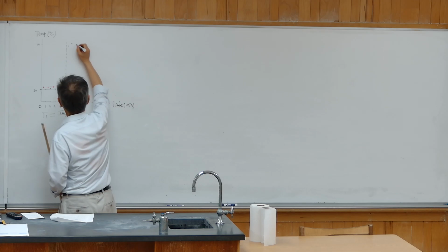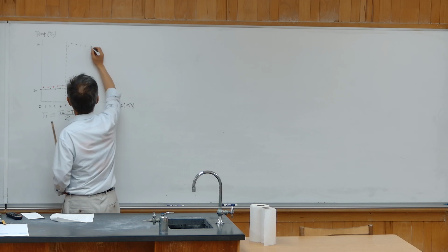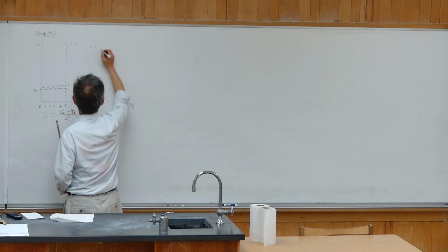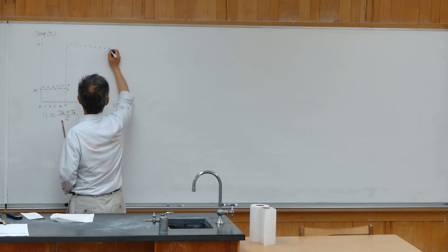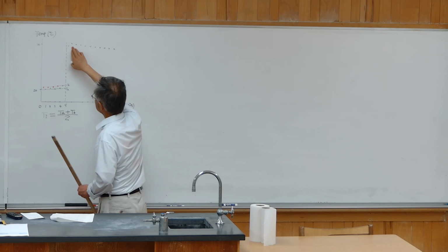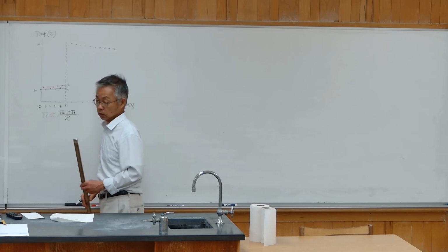And 7, drop a little bit. 8, drop a little bit again. 9, drop. 10, also drop some. 11, drop some. 12, drop some. 13, dropped again. 14, dropped again. And 15, dropped again. So you will find the temperature record like this. 5.5, 6, higher than 4.5. Then maybe start 7 degrees because this heat released to the surrounding.